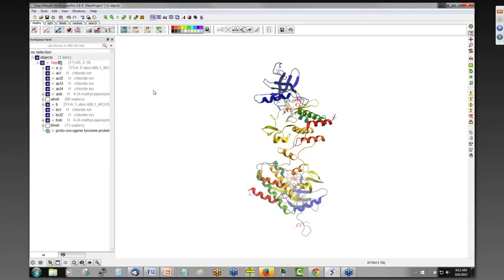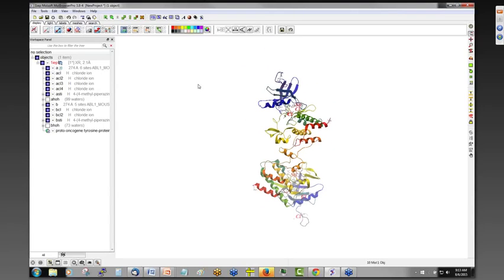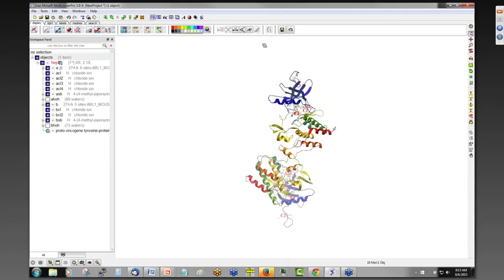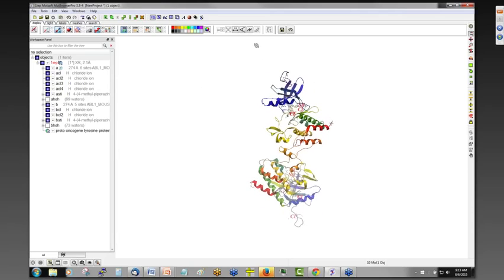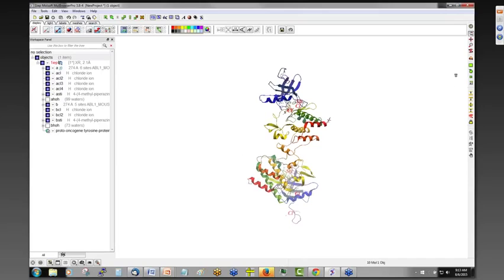So you can see I have the cursor key here, but if I move it along to this region of the display, it turns into a zoom button. And likewise, if I move the cursor to the top, it turns into a Z rotation. And you can also use the button for translation. And the clipping planes, which I'll show, are on the right-hand side. So it's just a quick way of getting to these options.